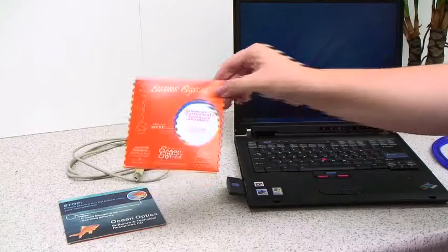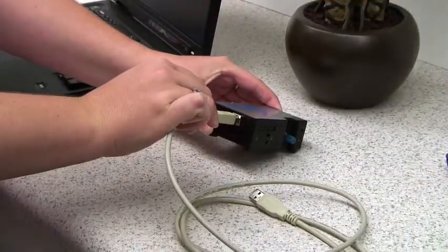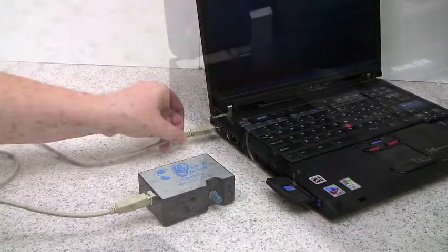Thank you for choosing an Ocean Optics Spectrometer for your application needs. In this video, we'll demonstrate the basic steps you'll need to take to get started with your new Ocean Optics Spectrometer.